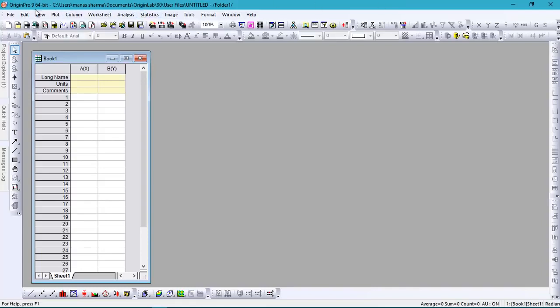Another thing to know is that I'm not sure about it, but I don't think that Origin versions earlier than 8 or 8.5 can do this. I have Origin 9, but make sure you get the latest Origin, because I'm not sure if versions before 8.5 could do that. I mean, they do have a wizard that performs a fit, but I'm not really sure how well that works.